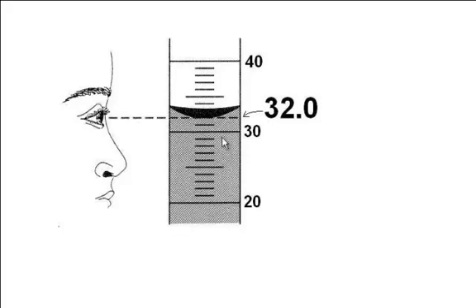Also, it's important that you know what the little lines mean. Obviously, that line's 30 milliliters, and this line is 40 milliliters. If you were to count, you would count 10 equally spaced segments. So each line is 1/10 of a milliliter. Or I'm sorry, each line is 1 milliliter, because the difference between 30 and 40 is 10. So how much fluid is in this graduated cylinder? Well, as you can see here, it's 32 milliliters.